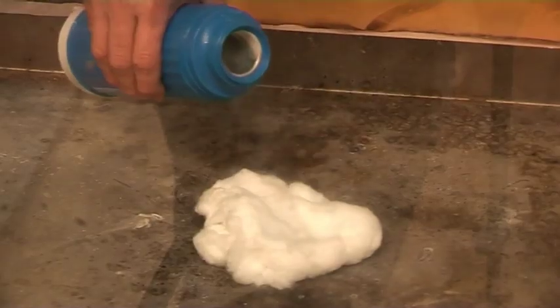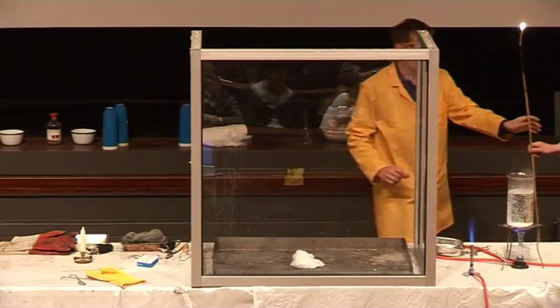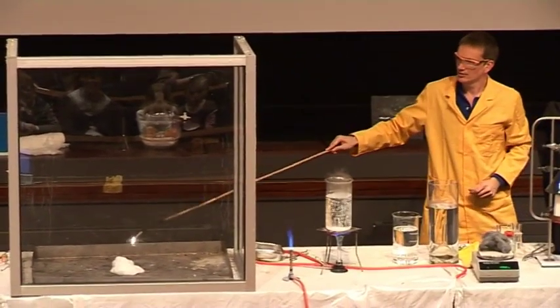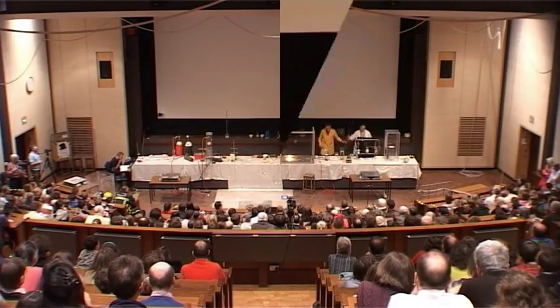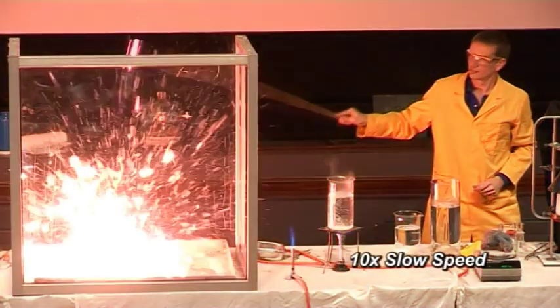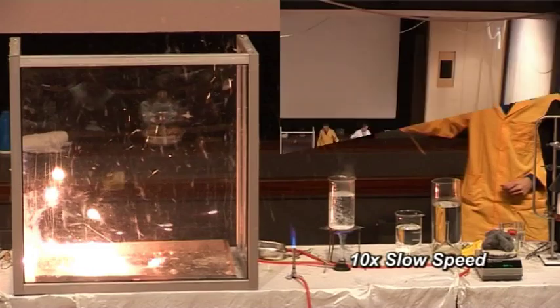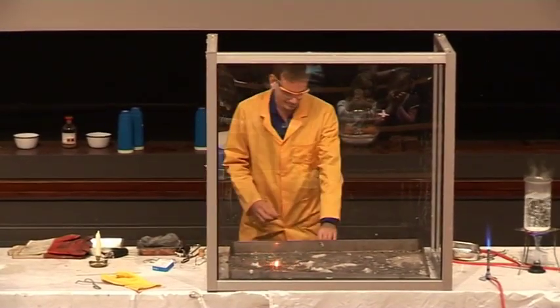I'm just pouring on some liquid oxygen, and we'll apply light to this and see if it burns more quickly. Okay, so a little bit of oxygen helps enormously.